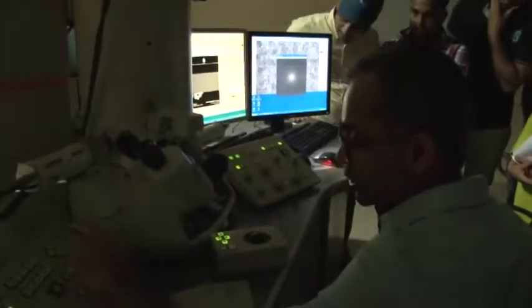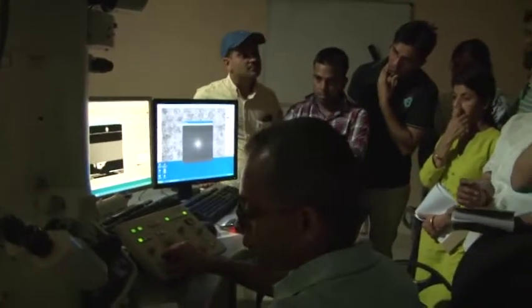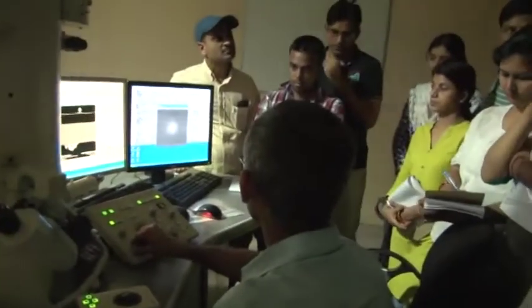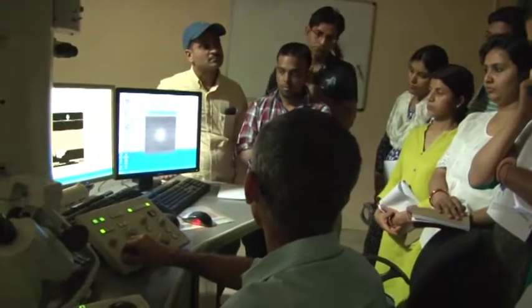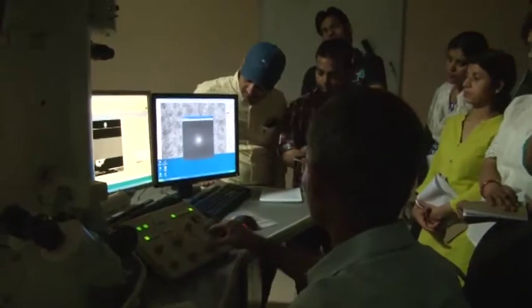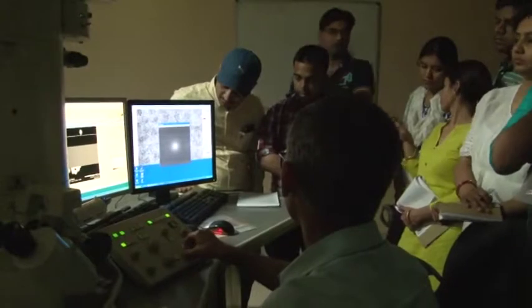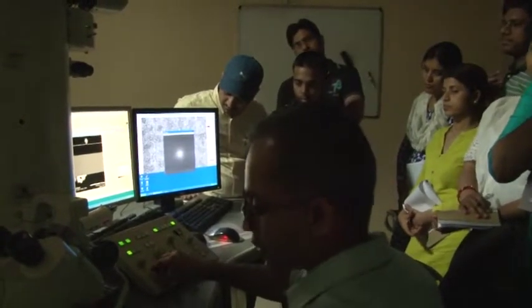So I go to the objective stigmator. It depends on the defocus for such a microscope. There are different defocus values which are optimal. One is the best point resolution, which is Scherzer defocus. There's another one which gives you the least contrast, this is called Gaussian defocus, this is 0.